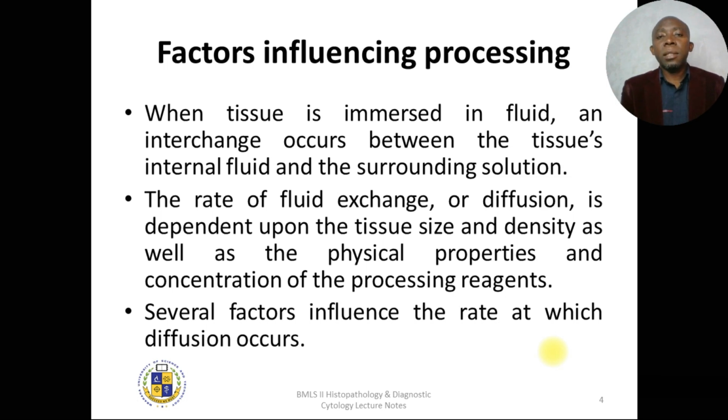So let's look at the factors which influence tissue processing. For those who have watched or attended my presentation on tissue fixation, you will realize that some of these factors are the same, because fixation is part of tissue processing. The factors we discussed, like the size of the tissue, concentration of the fixative, the time, the pH, osmolarity of the medium, are going to surface here too.